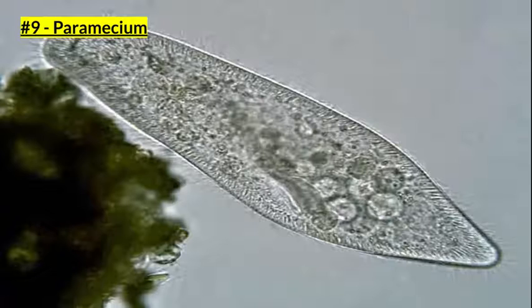A paramecium. The paramecium is not this big blob of dark green. It's actually the organism right there. So you can see there's only one cell to it. Paramecium have a lot of cilia, which you actually can see in the picture.